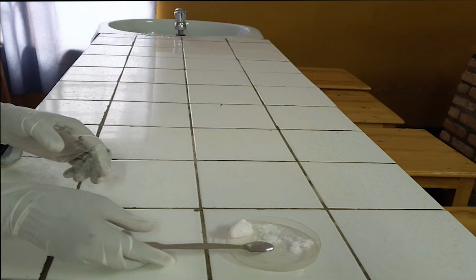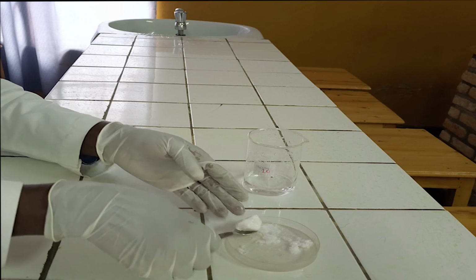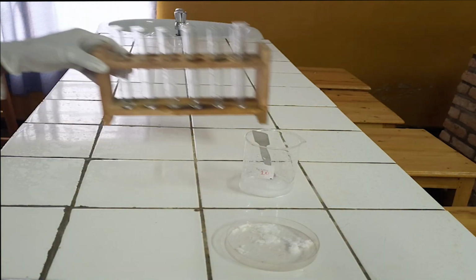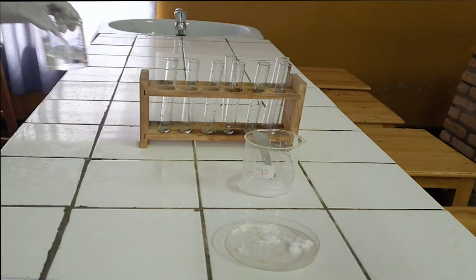Test for oxalate ion. First step, dissolve a spatula of salt in 50 ml of water. Chemicals required. 1. Lead nitrate solution.